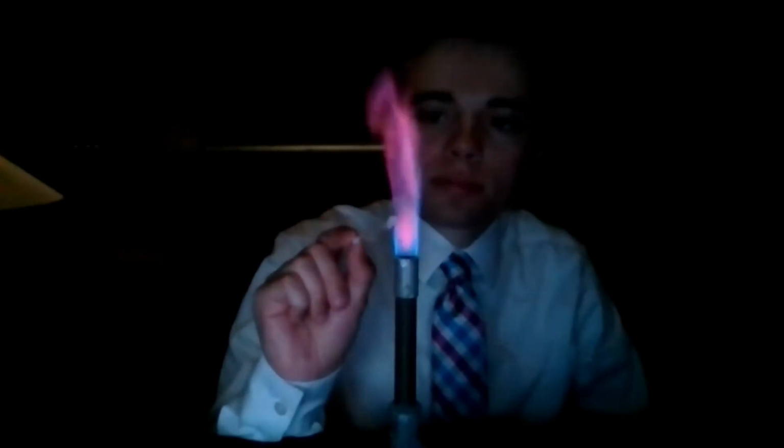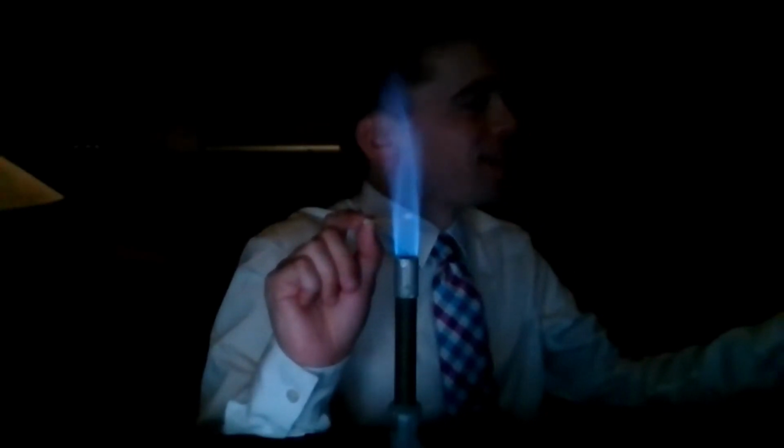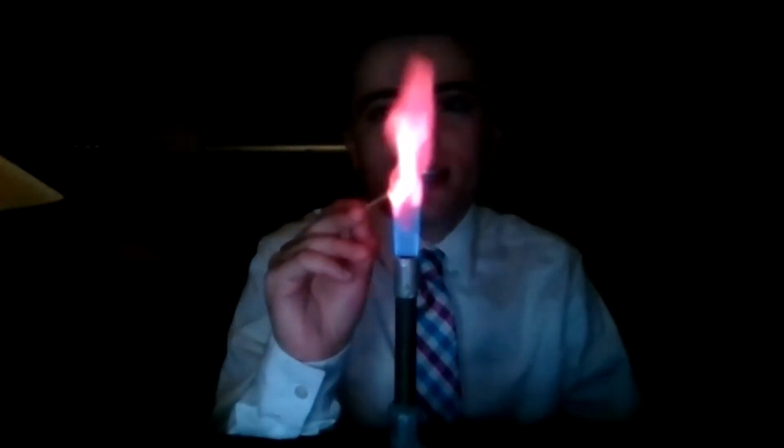This is unknown 1. It looks kind of reddish pink. Lithium. Don't yell it out. Well, where do I put that? It's one of the questions below: what metal ion do you think unknown 1 represents and why? Yes, but this one is lithium. Why is it lithium? Because it's pink. Yeah, it has that pink red flame on it. We can tell it's lithium.